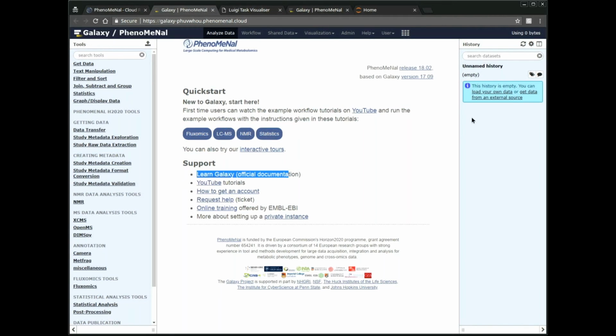In essence, what you would have is a list of data sets here. Some of them would be the ones that you uploaded, and some of them would be the output of your analysis. At that stage, you could click on them and visualize them depending on what they are. If they're graphs, then maybe you could see them. An HTML layout page could be displayed directly within your browser. Data you would probably have to download and look at by some other means.